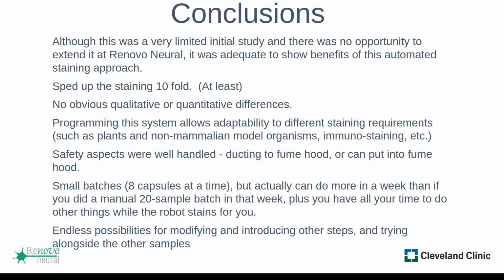So it ducts to your hood, and attached along the duct that goes from the system to your hood is like a vacuum fan type thing. I won't call it a vacuum. It's like a fan. I can let the microscopy innovation people talk about that. But yeah, so it sucks the air from the ASP1000 into the hood. Or you can put the system in the fume hood.